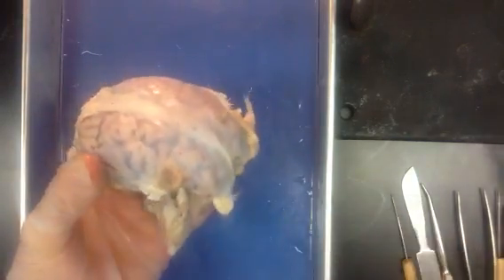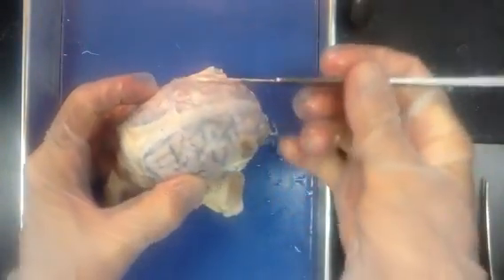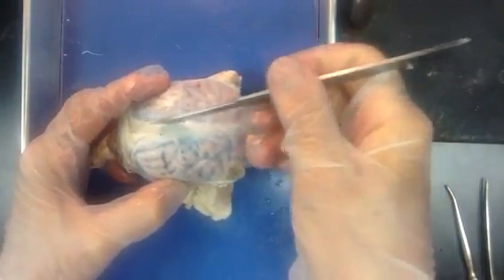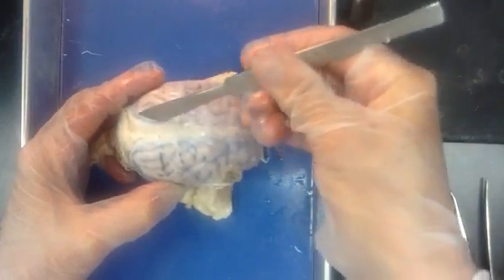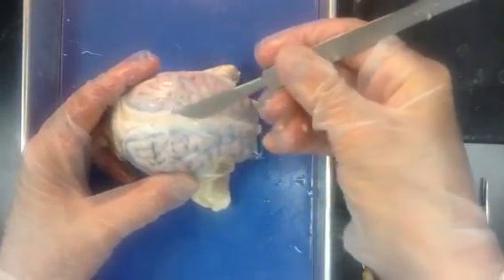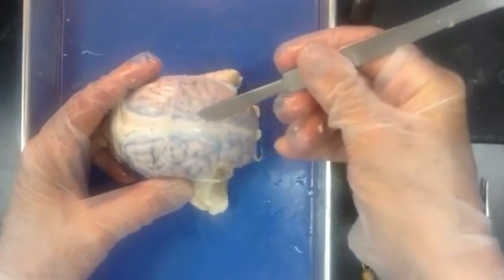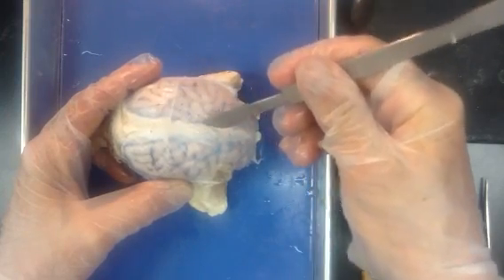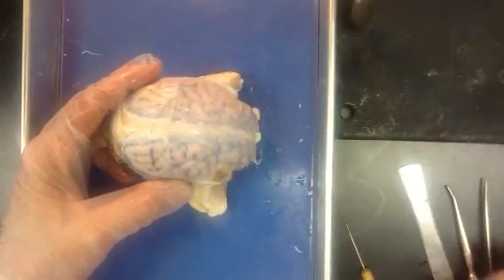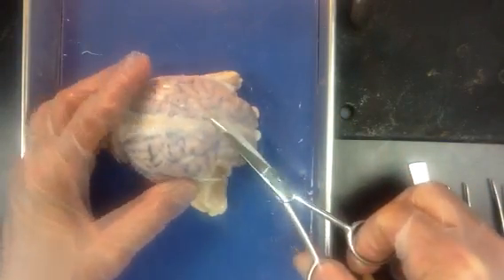If you use a scalpel, unfortunately that's not a good choice, because when you use a scalpel on something like this you'll cut and cut and cut trying to get this to open. It's very tough, like Tyvek — like those postal envelopes that cannot be torn, or what they wrap houses in for insulating. You'll push and push, and by the time it actually gets through, you'll smush that delicate brain tissue underneath. So I recommend a nice pair of pointy-tipped scissors.